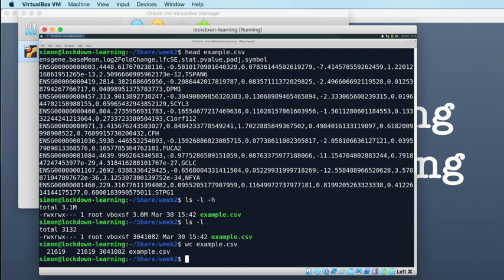So the last one is the character count. The middle one is the line count. And now I can't remember, so I'm going to read the man page to tell me exactly what wc does. When you use so many tools at the command line, you can never remember exactly what every single one of them does. So it can be quite useful to remember that you can look up in the man page exactly what the results mean. So you can see we've got 3 numbers.